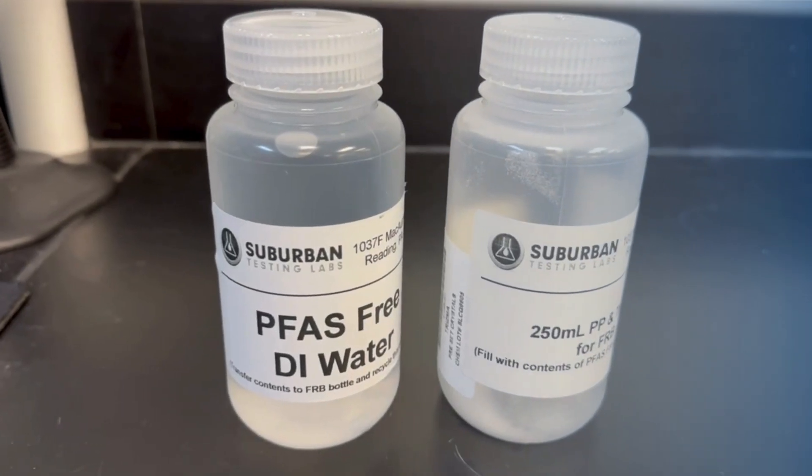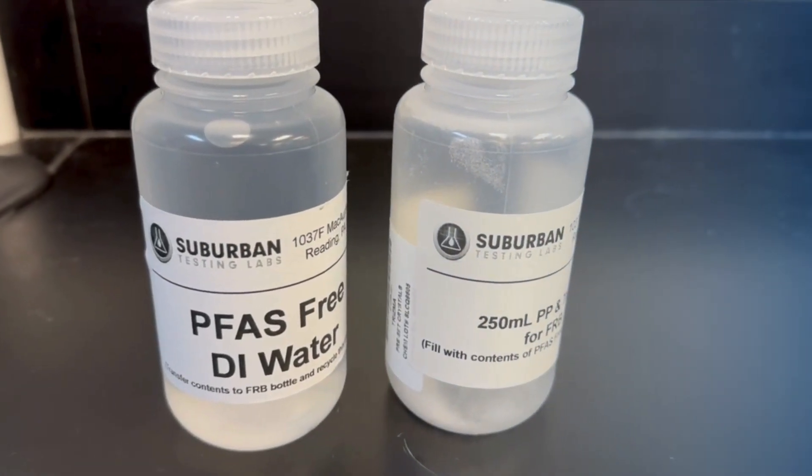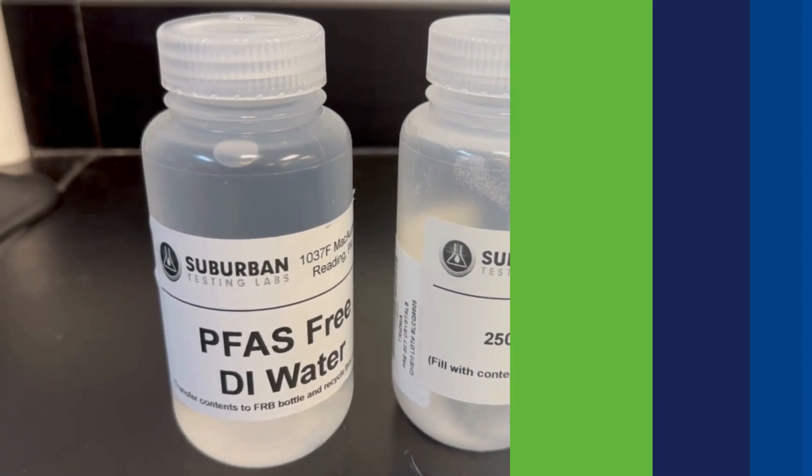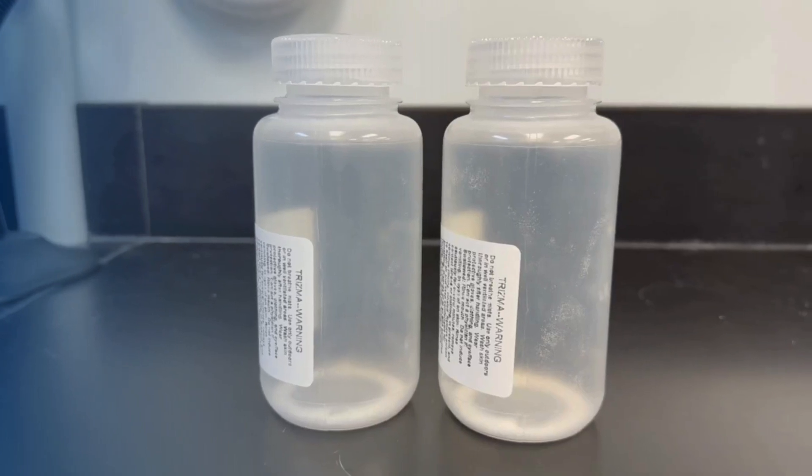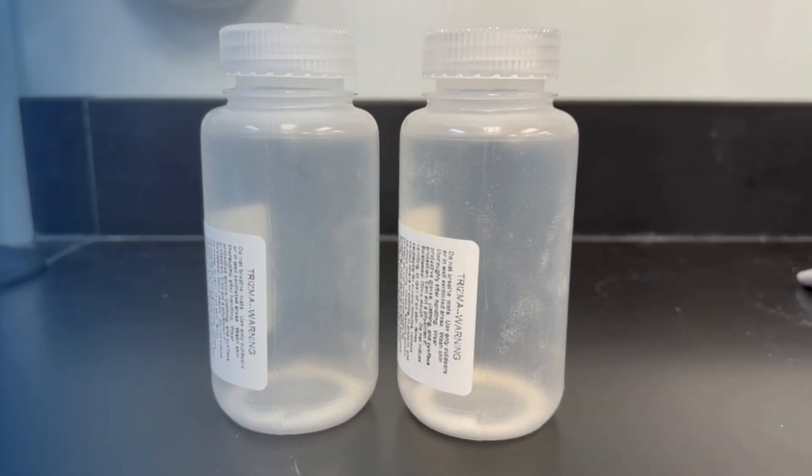You will also have a field reagent blank bottle filled with PFAS-free DI water and an empty bottle to fill the field reagent blank. You will also have sampling containers that are pre-preserved with Trisma.